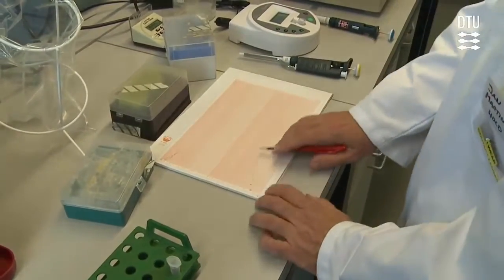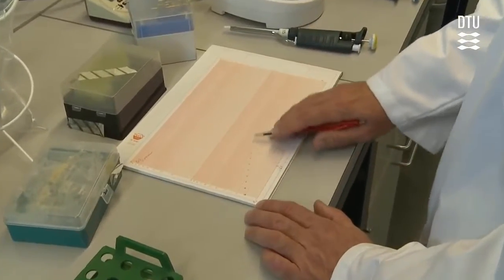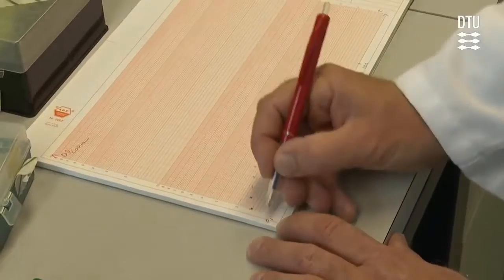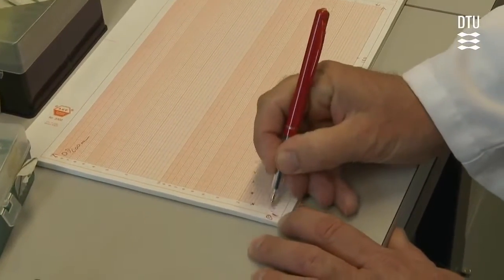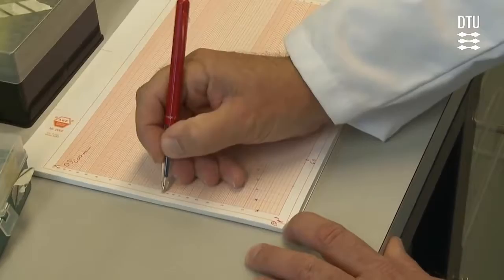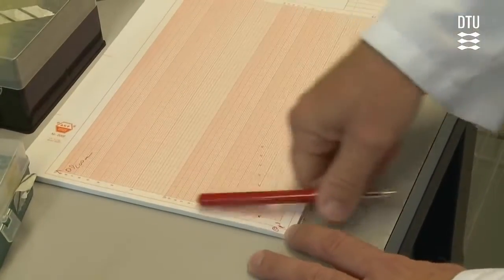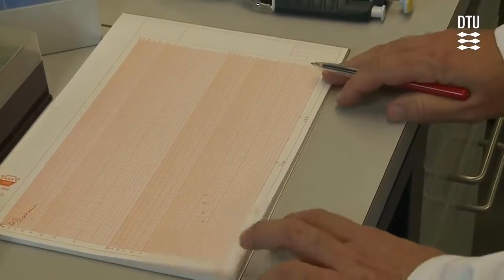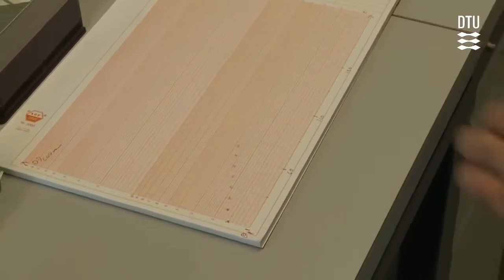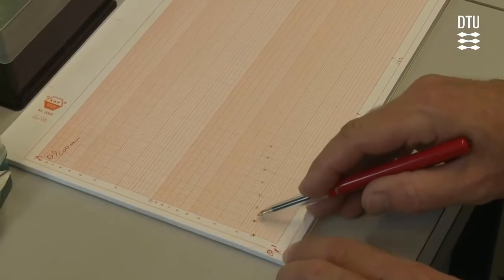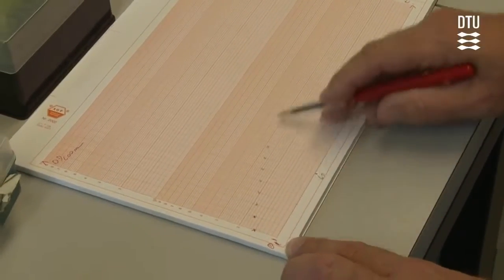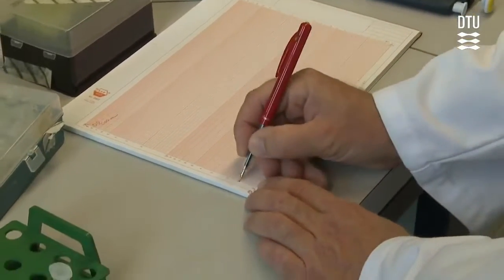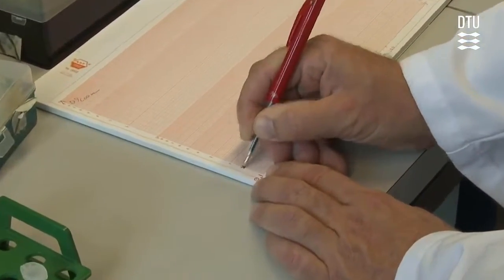Now we plot that value into a semi-logarithmic plot. You can see I did a previous experiment, so you can see how it's supposed to go. We start by plotting the first value, 0.15. The y-axis is the optical density and the x-axis is the time. One centimeter equals 10 minutes, and you can plot the values and follow the growth.